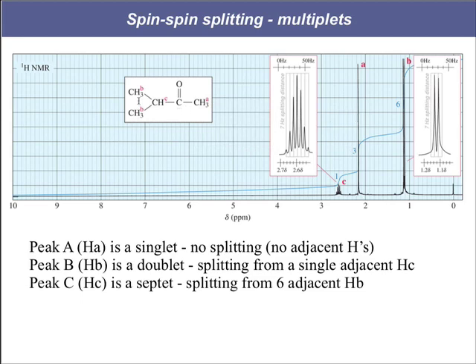Let's look at the B's. Notice that the B hydrogens, these two methyl groups, they're identical. They are on the same carbon, so they are in the same chemical environment. We've got 6 hydrogens there, but how many are they next to? These 3 are next to that one, the one on carbon C, and these 3 are next to 1. Again, these are identical.